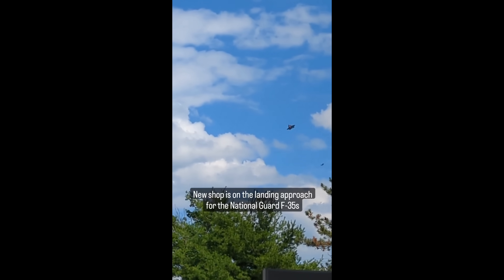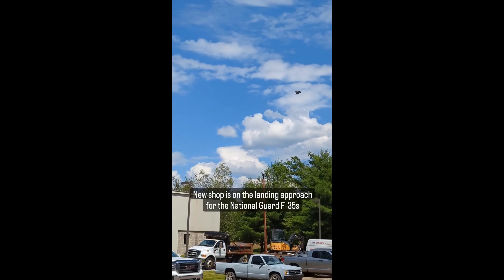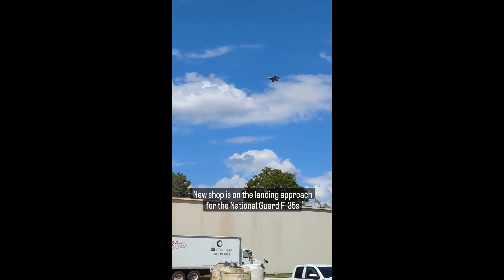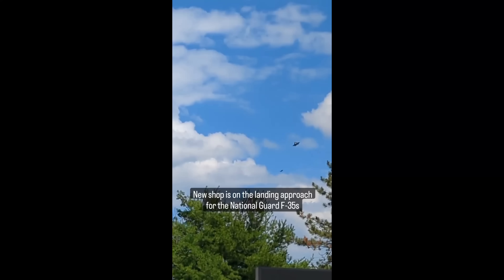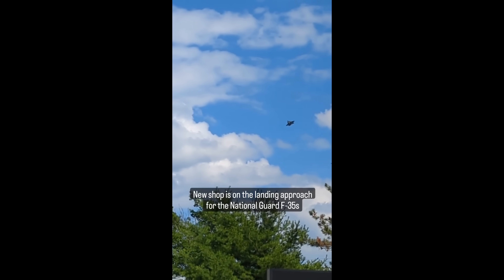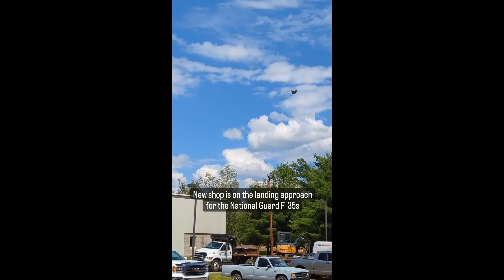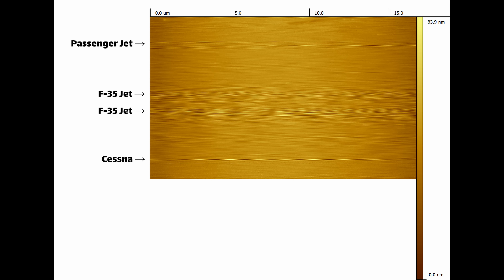A quick and sort of funny aside: my shop is right by the airport, and a couple times a day the National Guard will land their F-35s, which are super loud and typically just kind of annoying. But when you're trying to make a very sensitive nanometer-level scan with an AFM, it basically ruins your scan because the acoustics of those jets landing puts a huge noise spike into your scan and totals it. So that was fun today, dealing with the jets landing.